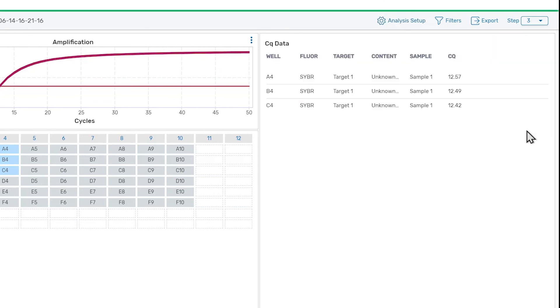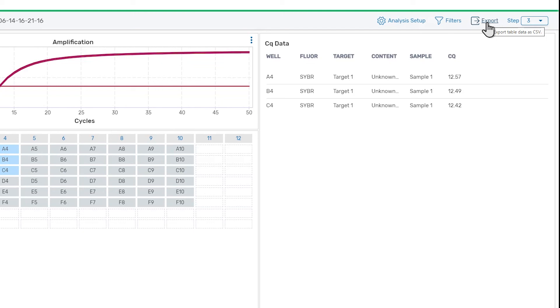Once you have reviewed the data, you can export the data table by clicking the Export button on the toolbar. This will generate and download a CSV file of the data table. The exported data table will match the data table as it is currently shown, except that CQ values will not be rounded. Make sure that the filters are set appropriately and all wells that you want to export are visible before you export the data.